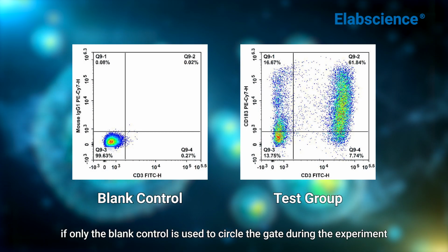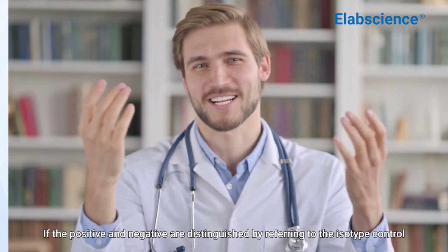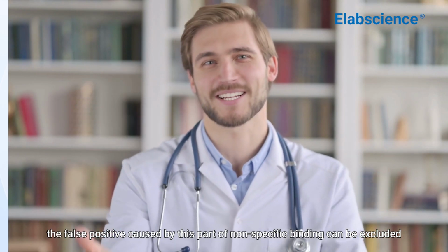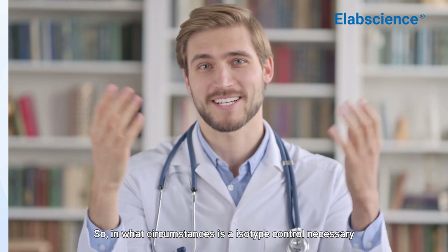Therefore, if only the blank control is used to circle the gate during the experiment, some false positive results may occur. If the positive and negative are distinguished by referring to the isotype control, the false positive caused by this part of non-specific binding can be excluded. So, in what circumstances is isotype control necessary?